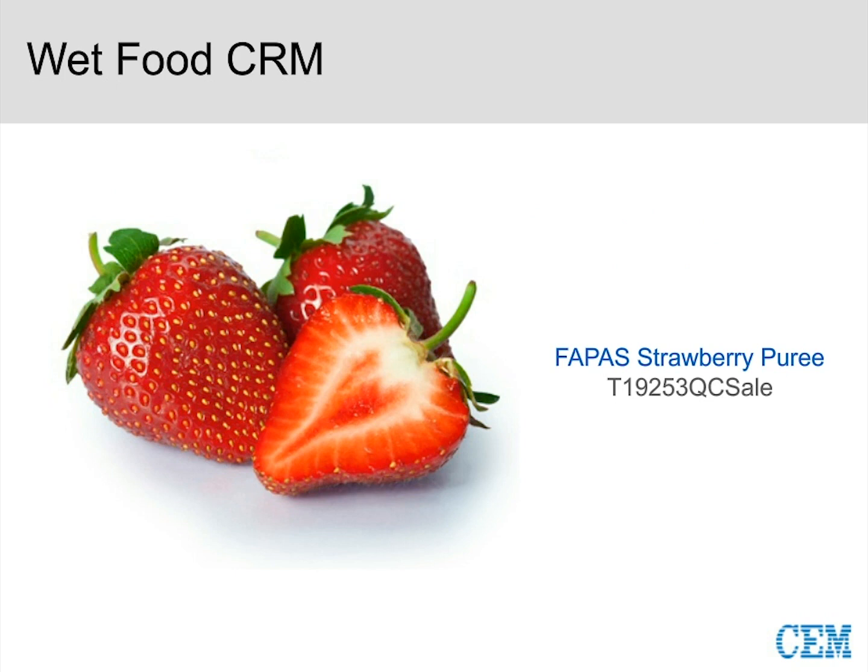And so I fully expect that QuEChERS should shine well for this particular type of sample. And so I am so thankful that in today's world, we're getting more and more CRMs available in the food sector. That has not always been the case. So it's great to be able to run a CRM. We all know that with spiking, it's easier to extract something that was spiked than a pesticide that was incurred. So with this development of food CRMs, it's just going to improve our data. And so that's really nice to be able to run a CRM.